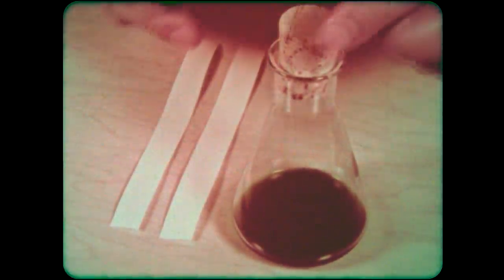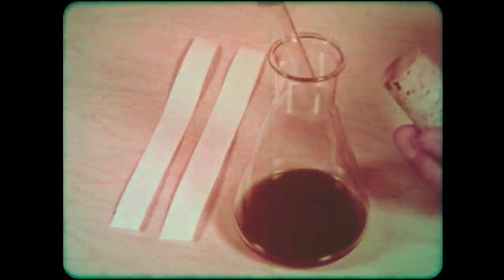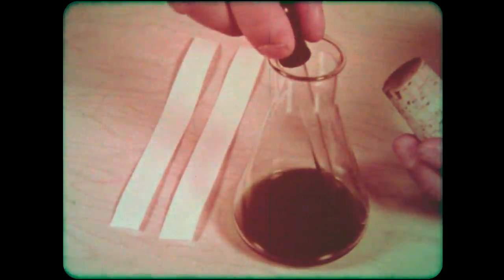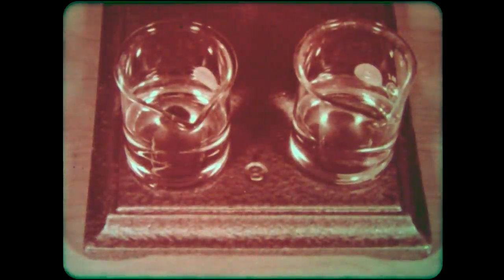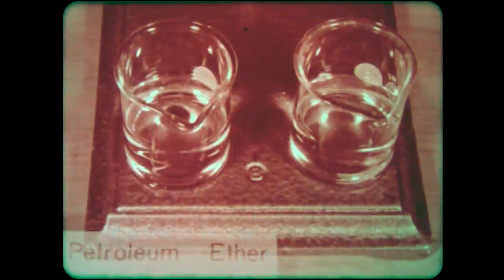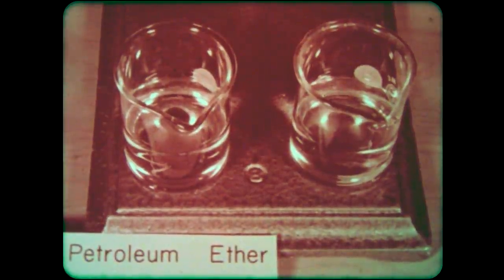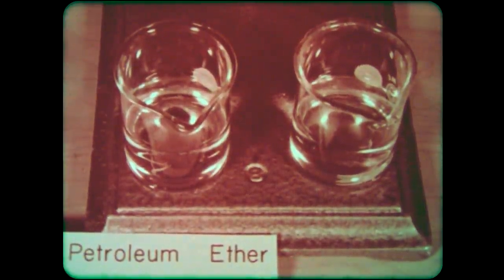A biological substance is now used: chlorophyll extract from the leaves of a Virginia creeper vine. Each spot must be allowed to dry thoroughly before the paper is placed in the solvent. Changing to more effective solvents, petroleum ether is in one beaker and acetone in the other.